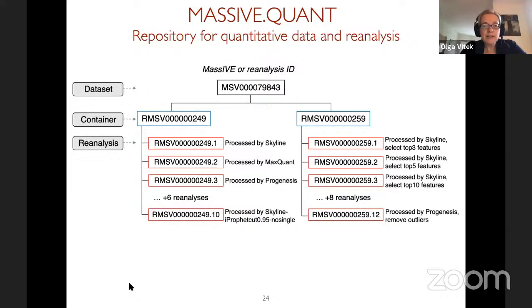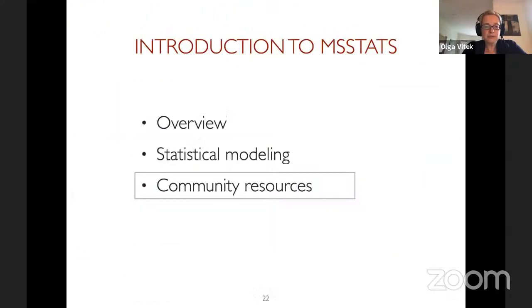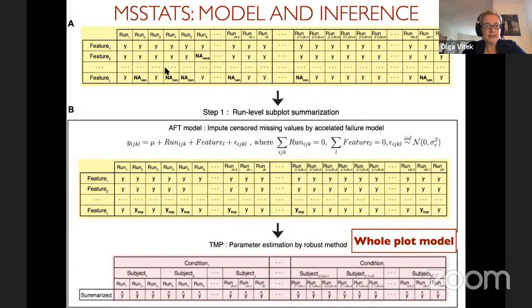The question is why there is still an empty cell of feature 2 and run 6. So I think you're probably referring to this. So feature 2 and run 6, yes. So this is what I said earlier, that some of the features we leave as missing.